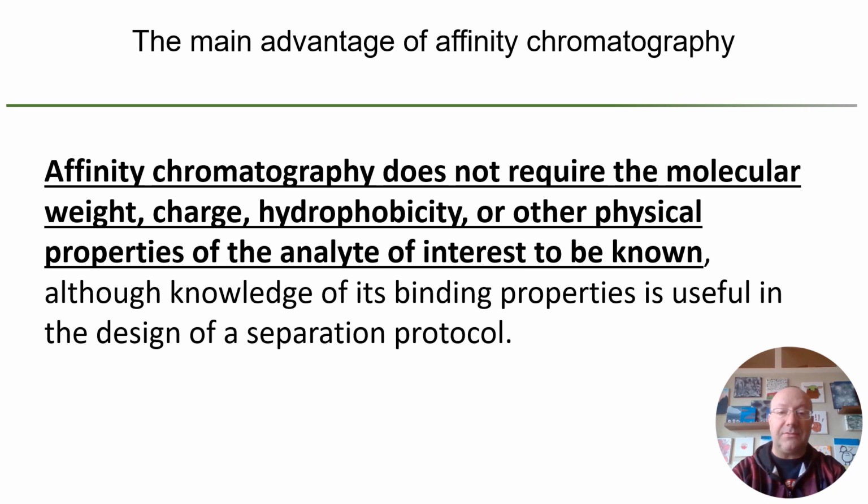The main advantage of affinity chromatography is that it does not require molecular weight, charge, hydrophobicity, or other physical properties of the analyte of interest to be known. The only thing that you need to know is the binding properties of the analyte to the ligand.